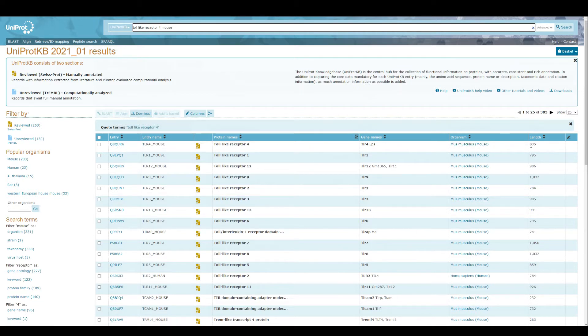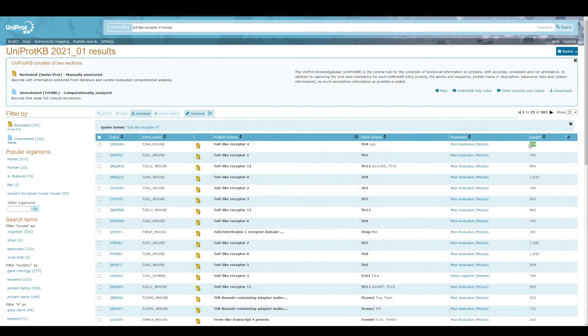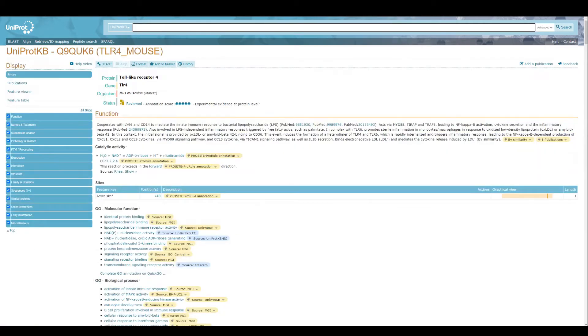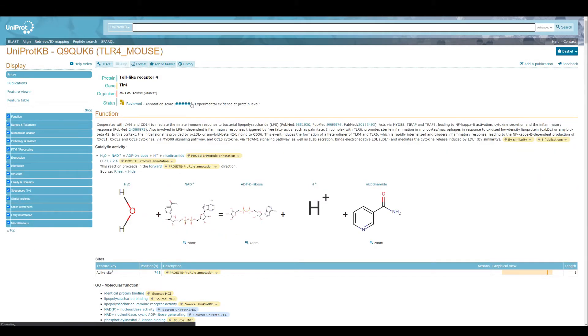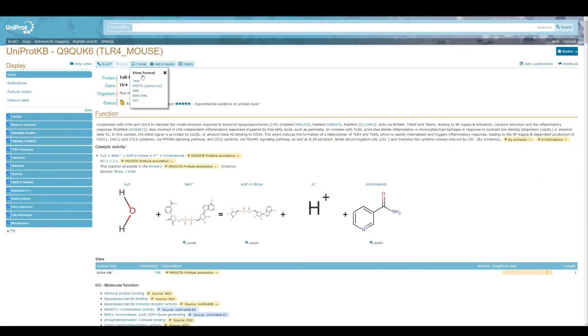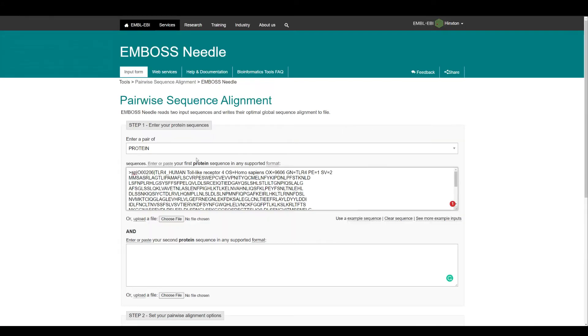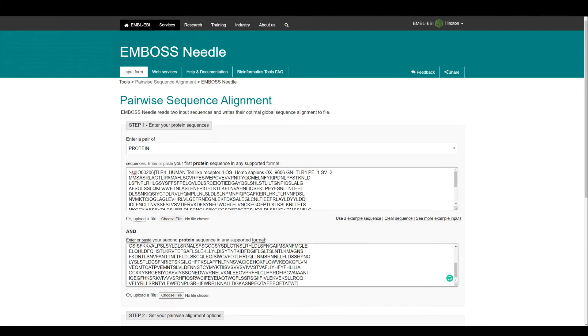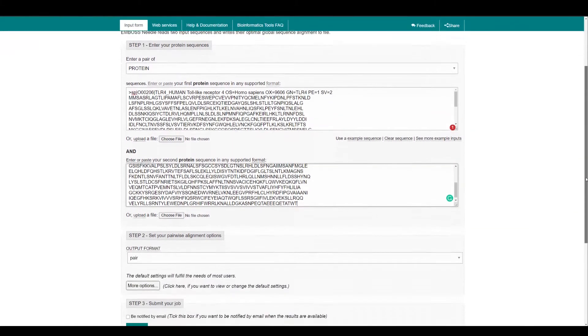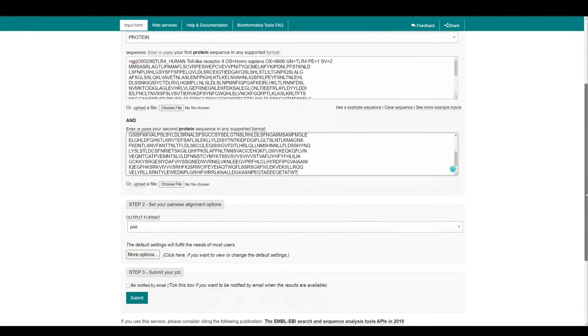So let's try to find mouse toll-like receptor 4. The length is 835, it's shorter than the human sequence. Now I'm going to download the FASTA canonical sequence and copy this sequence and paste this into the second window.